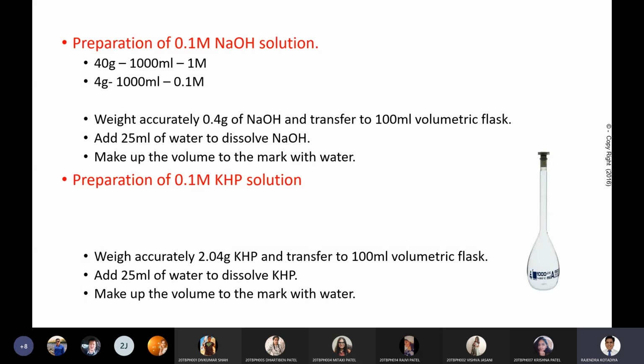Okay, do this calculation like this. For 1 molar, 40 gram. For 0.1 molar, how much? And then cross multiply. Okay, that's wrong, that's okay. When you make such mistakes, then you will get the concept very clear. Suppose you don't make a mistake and the answer comes, then it could be said the answer came by a guess. So it is better to make mistakes.